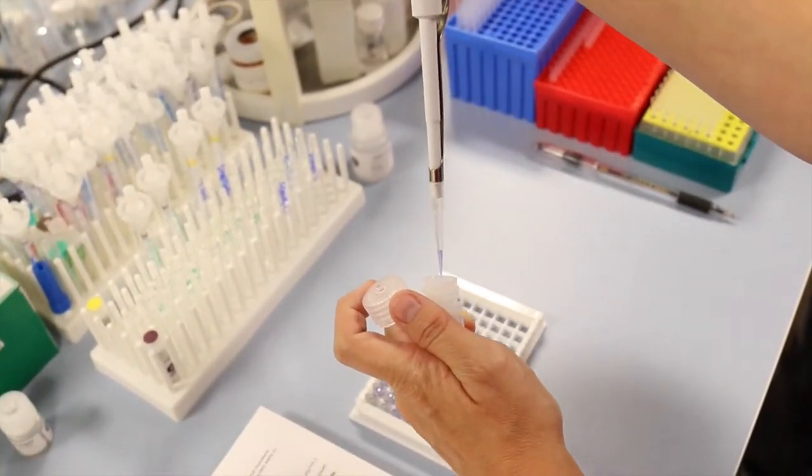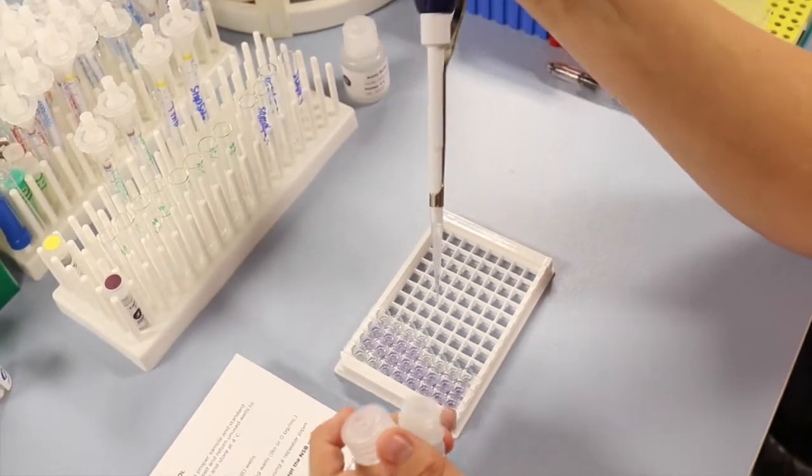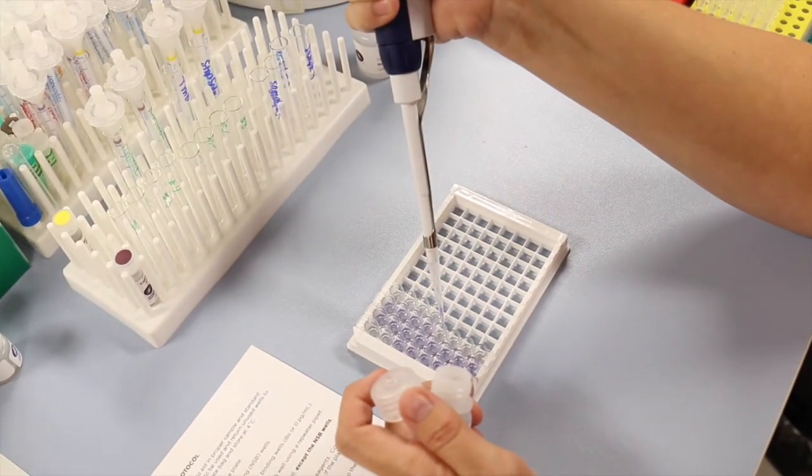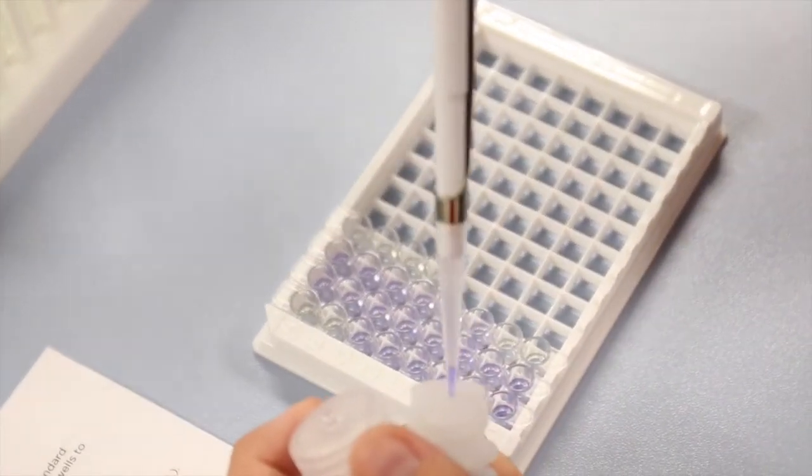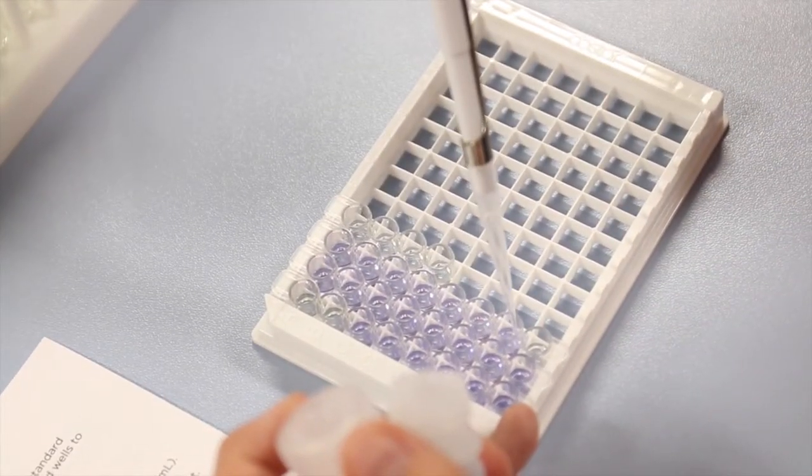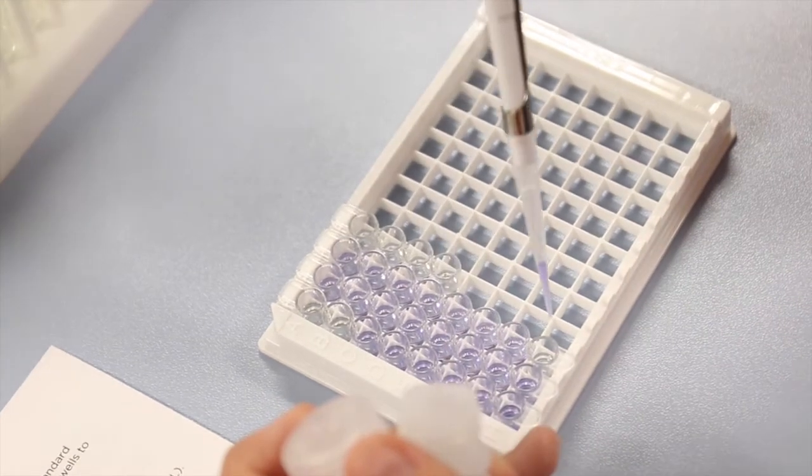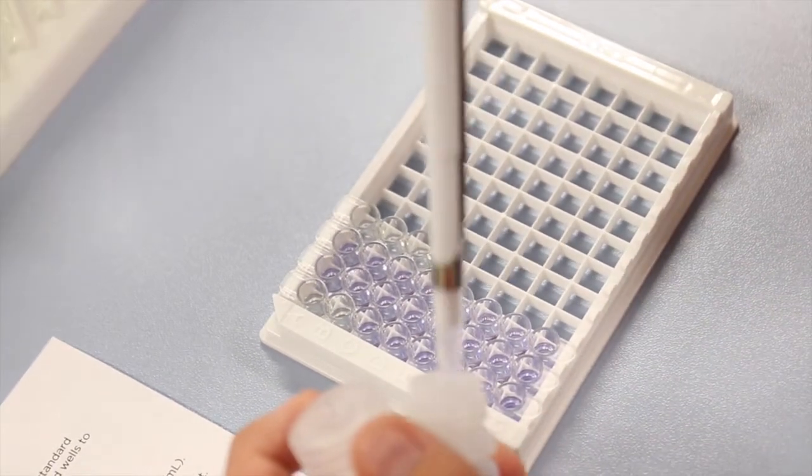If you are using a non-repeating or single tip pipette to add conjugate or antibody, pipette the conjugate towards the top of the well. Add the antibody on the other side of the well, also towards the top of the well.